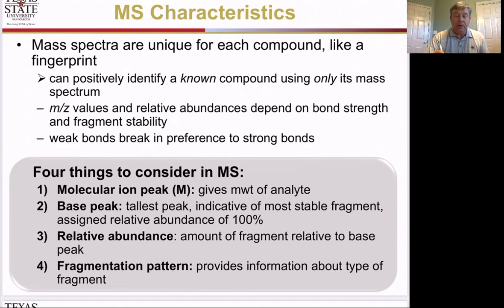All right, so let's start with just the fragmentation of pentane.